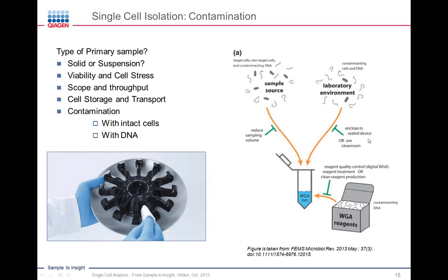It can come from your laboratory. You need to be really careful about this and run your single cell experiments maybe somewhere a little more clean. You need to use UV and sodium hydroxide or whatever sort of decontamination protocols need to be in place. They should be quite stringent. And then the final place is that the reagents you use for the whole genome amplification, these can also carry DNA or cells into your reaction. So you need to be especially careful about what sort of buffers and what water you're using for these procedures.